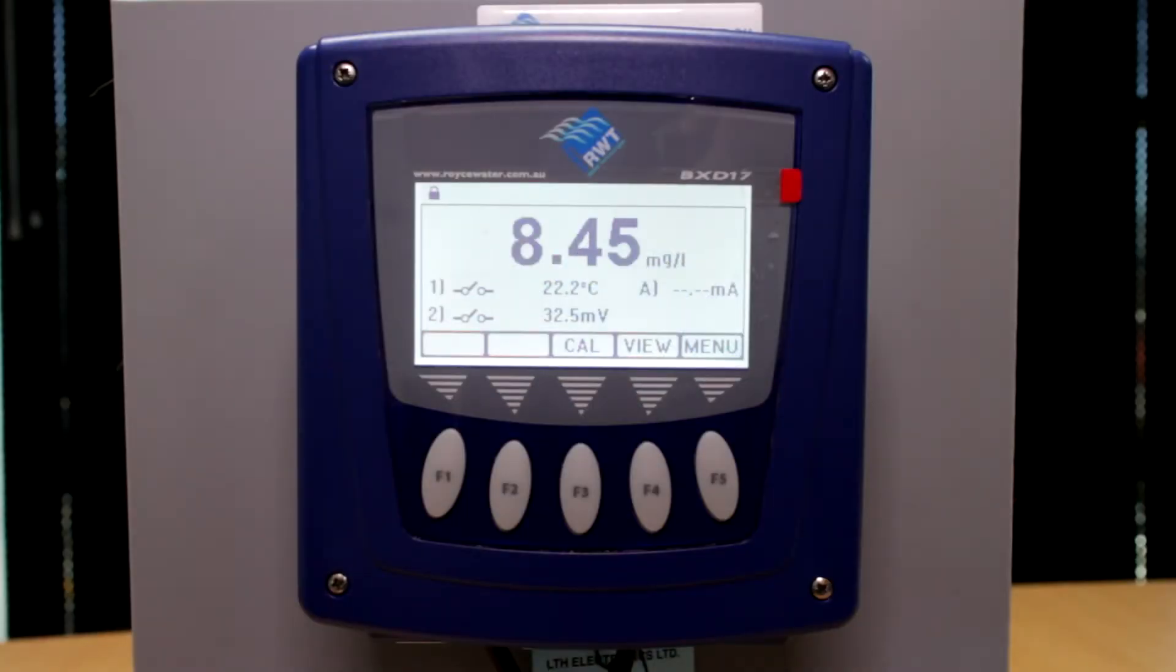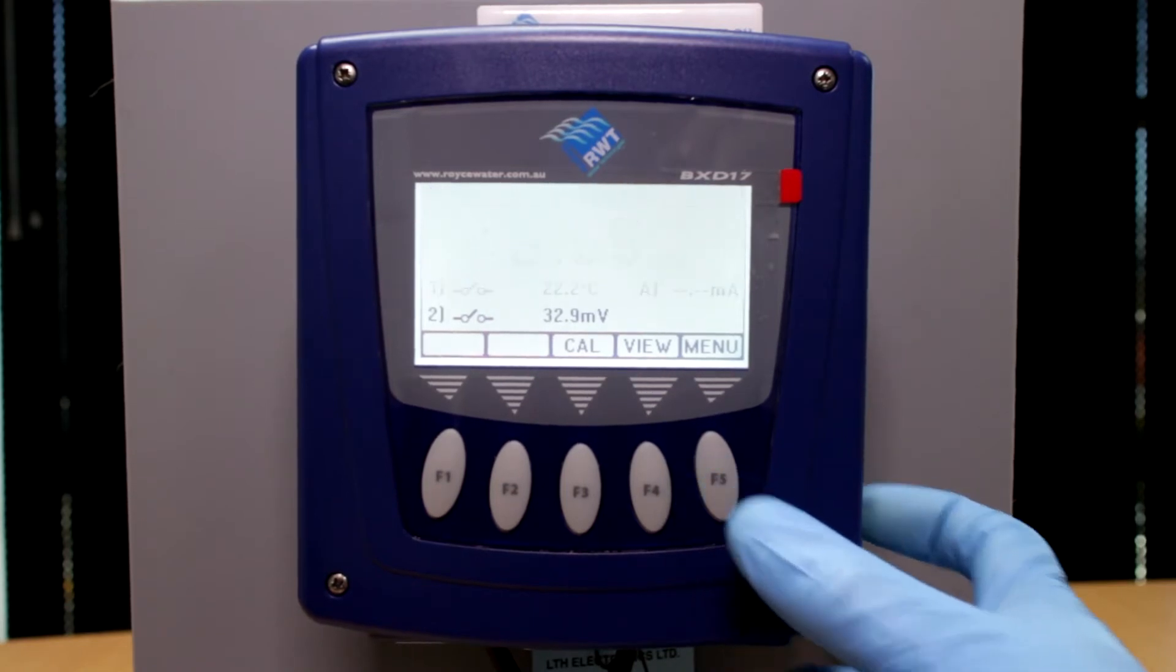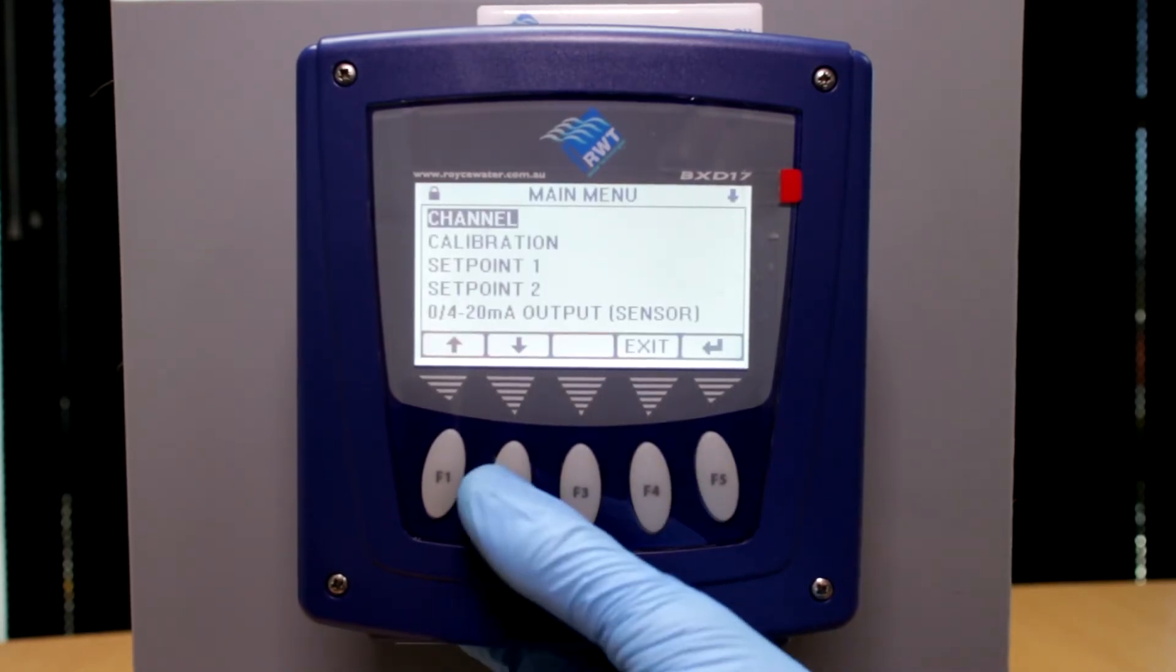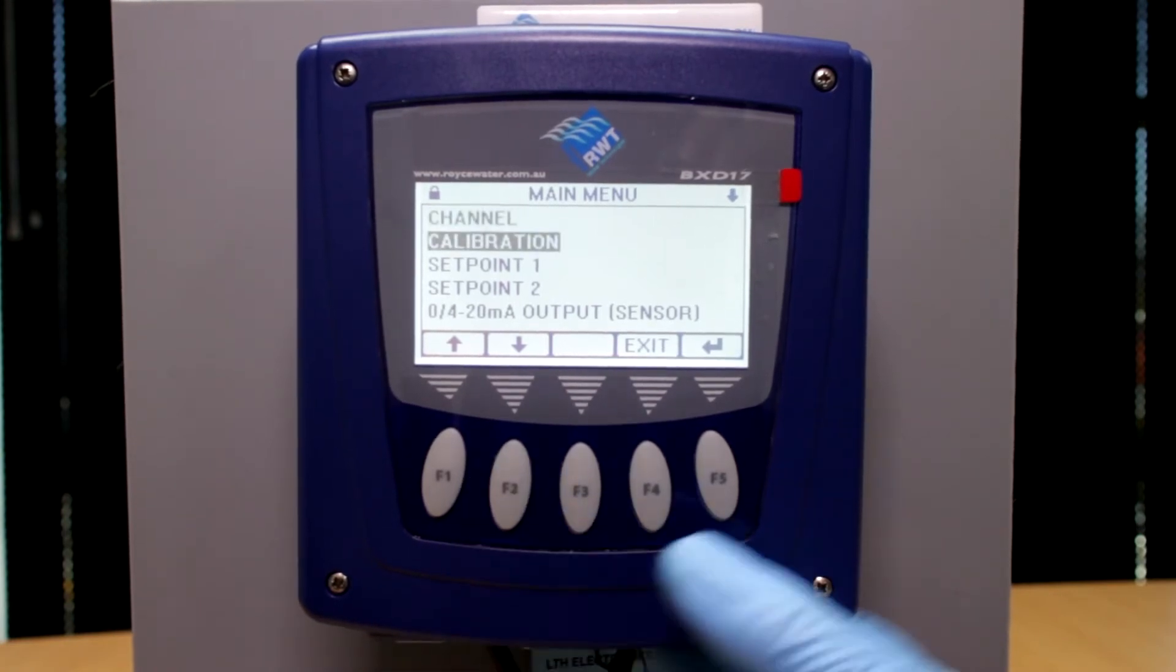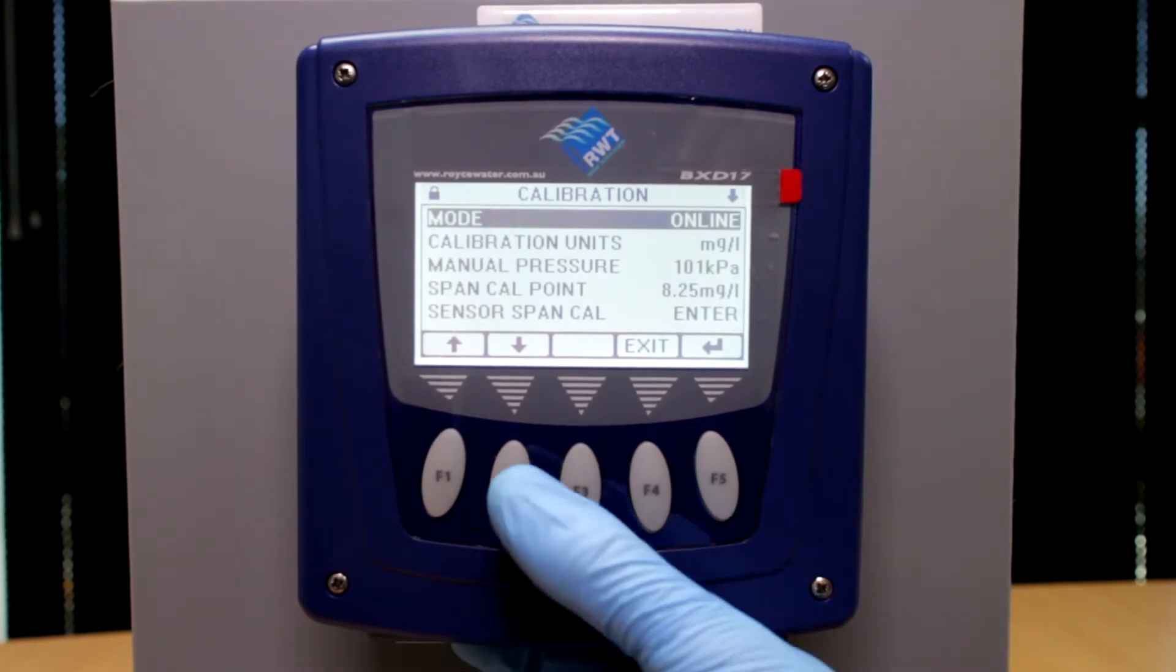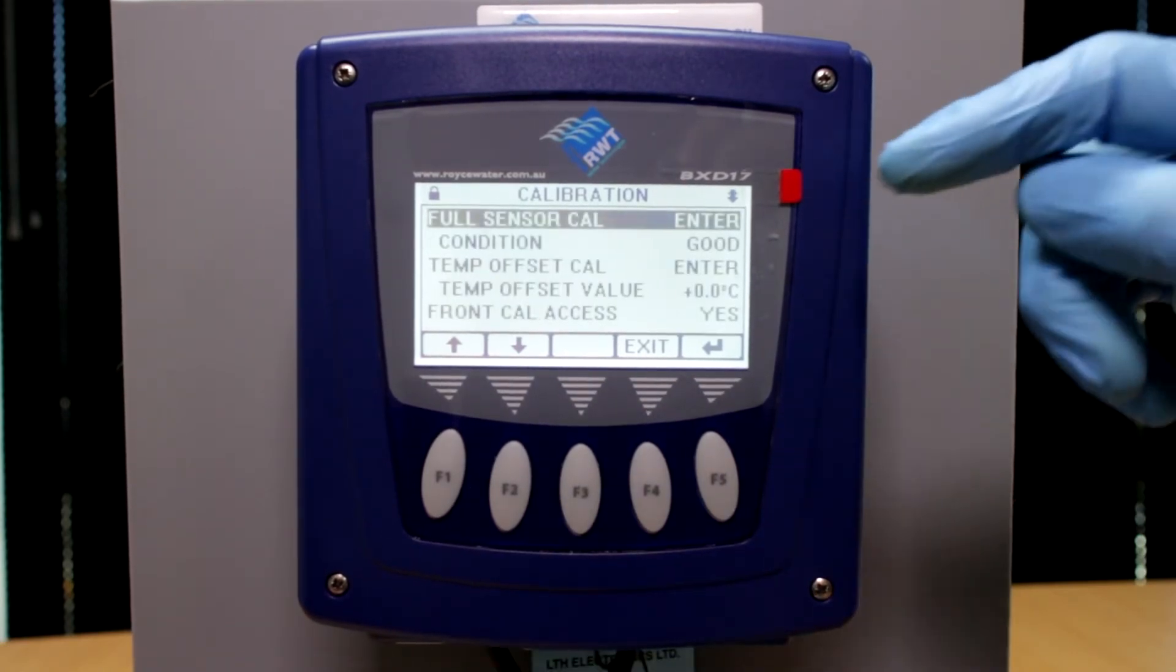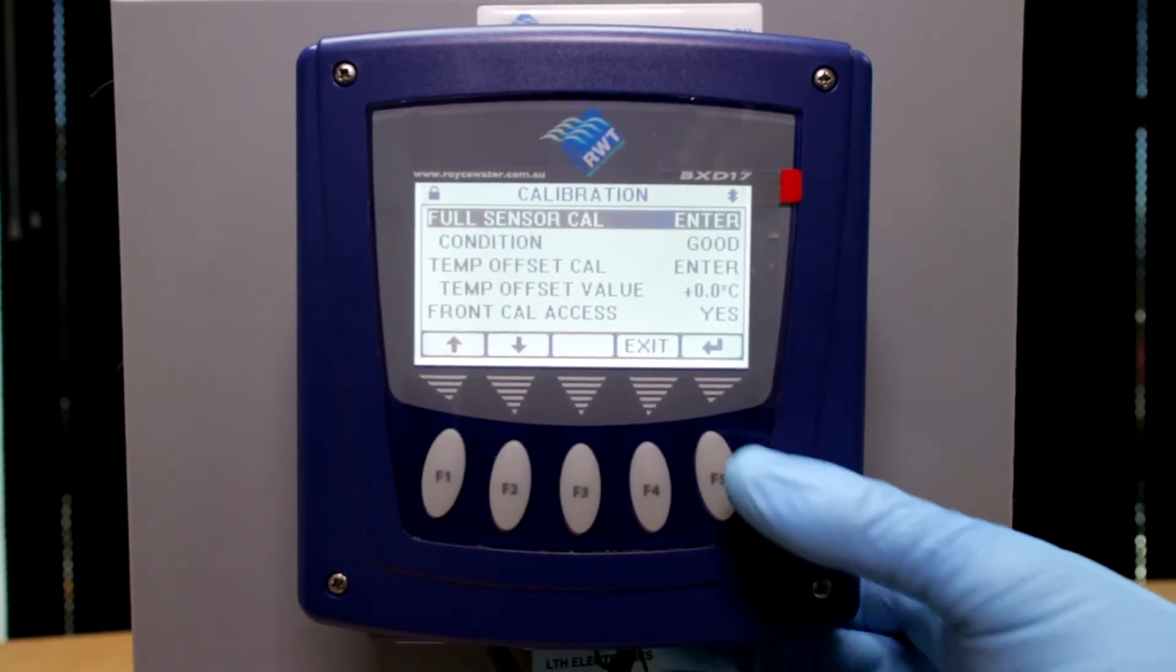Should you wish to calibrate zero on your Royce G95A dissolved oxygen sensor, we first prepare some zero DO solution. If you don't have access to zero DO solution, you can use RAS or WAS. Hit menu which is F5, and then scroll down to calibration using F2. Push enter, scroll right down using the F2 key until we get to full sensor calibration and push enter.